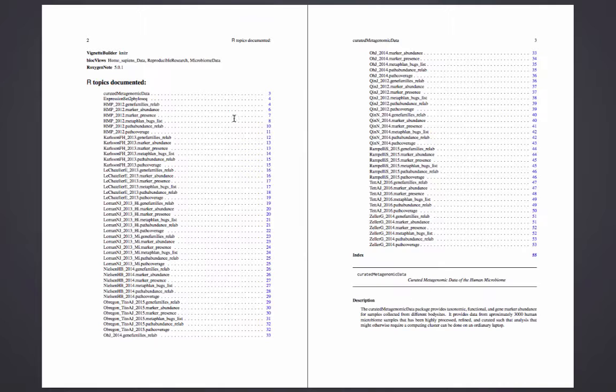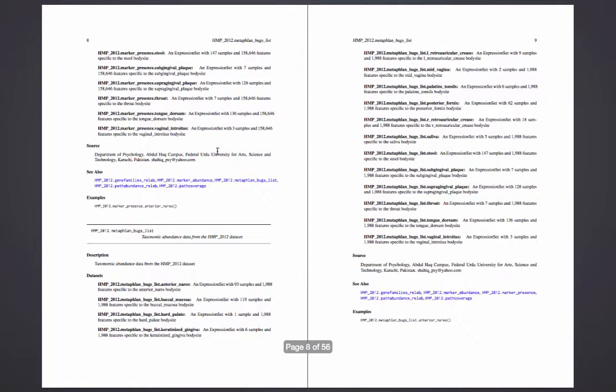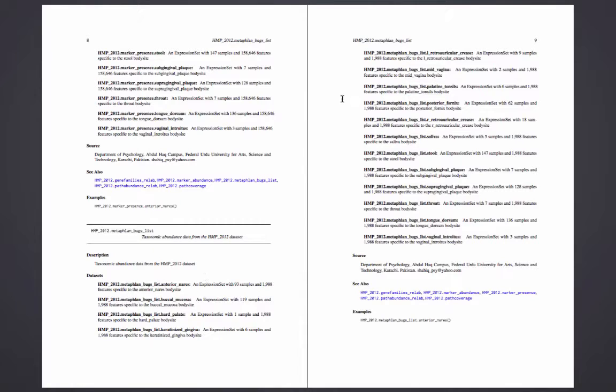For the HMP you see there are actually one of these functions for each of the body sites. There are about 15 of these.